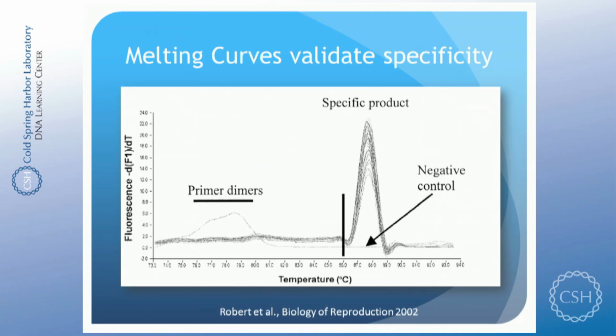In this case, this is the negative control, and in the negative control, it is fairly common that you get that because there's nothing to amplify really. So that's okay here, but in your specific product, you really just want 1 single peak.